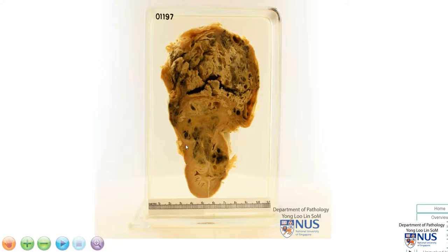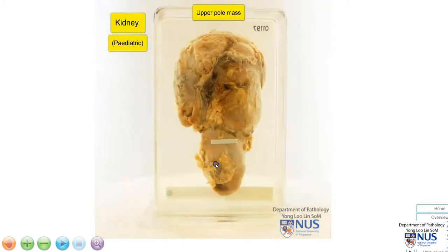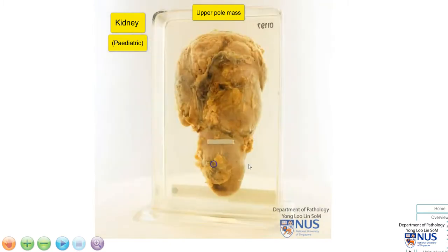Hello, this is a specimen of a kidney with a very large upper pole mass. Looking at the size of this kidney, it is actually relatively small, so this is the kidney of a child. Let's turn this around, and we can see the capsular surface of the kidney here, which appears to be continuous with the location of the mass.